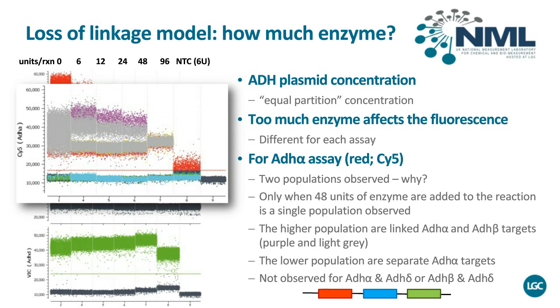And what's really interesting about this is that second population of reds that is higher, they only contain either purple or grey. So the hypothesis here is that the alpha and the beta have remained linked for some reason because there's a disproportionate number of purple droplets compared to blue or red. And then, of course, there's a probability that triple positive alongside a delta, and that maths followed. So what we had here was a really nice way of visually showing we hadn't added enough enzyme in order to efficiently separate the alpha and the beta.